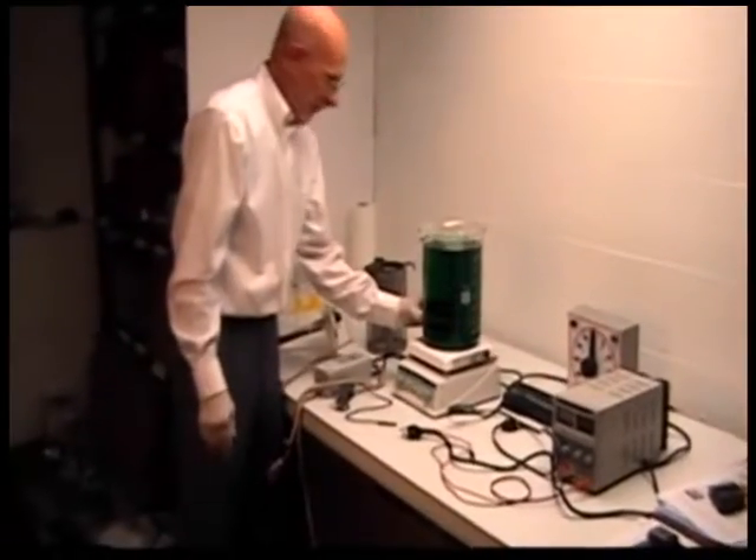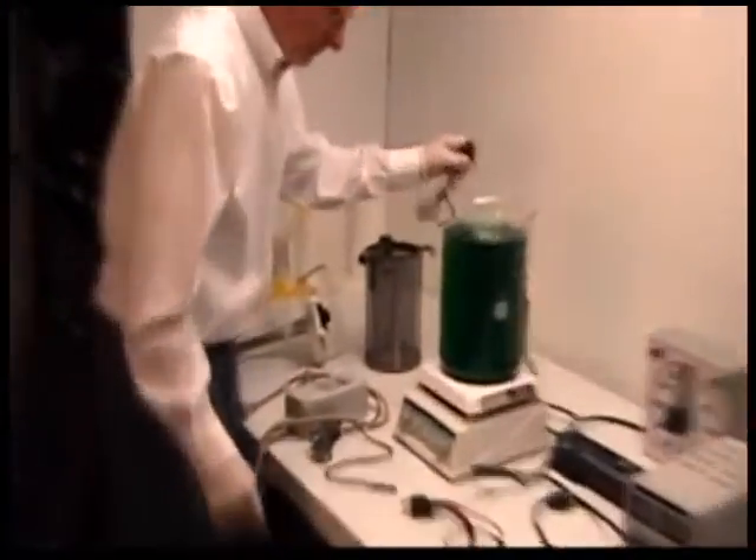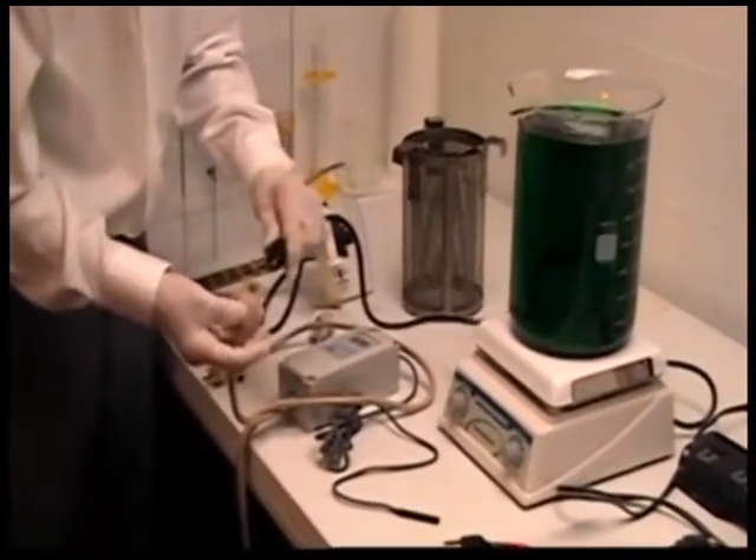We have a magnetic stirrer in the plating bath. We'll begin by plugging the hot plate into a temperature controller. Notice the short length here on the cord.